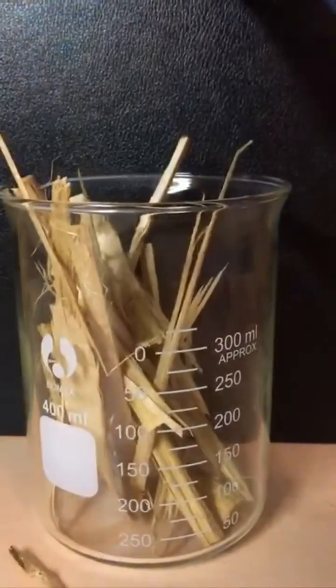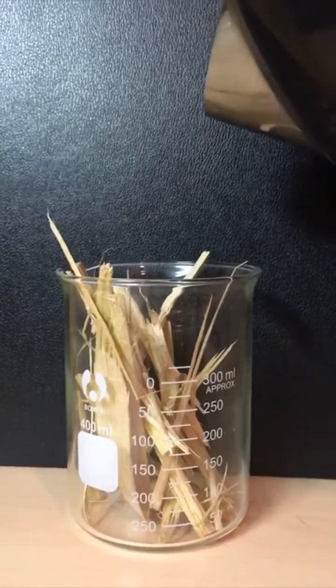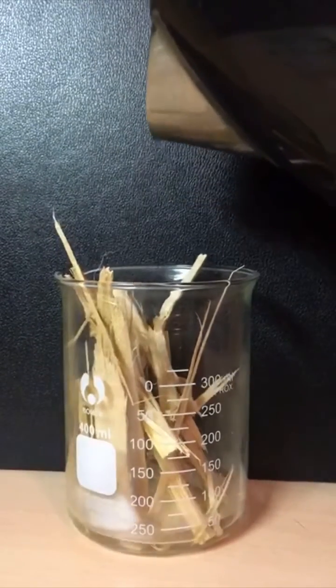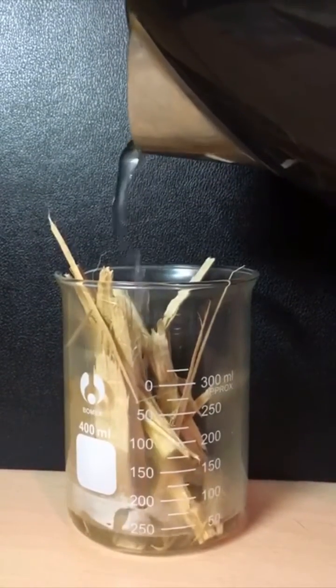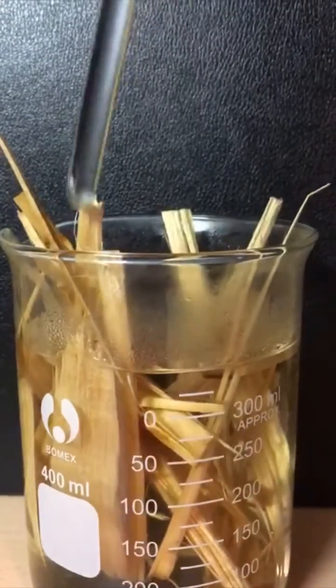Here I am adding some fairly small pieces of wood. To this I add a little over 300 milliliters of water — this is probably around 425 mils total. Stirring helps saturate the wood grains.